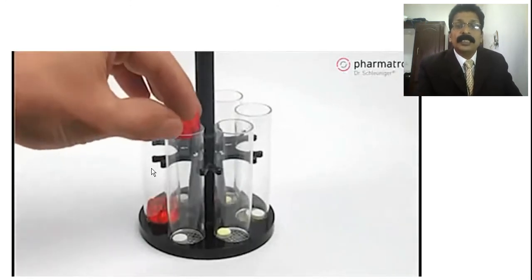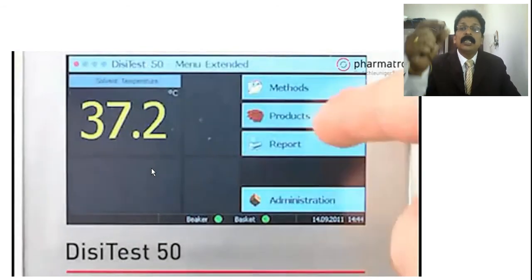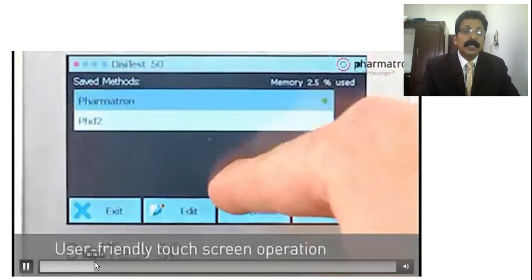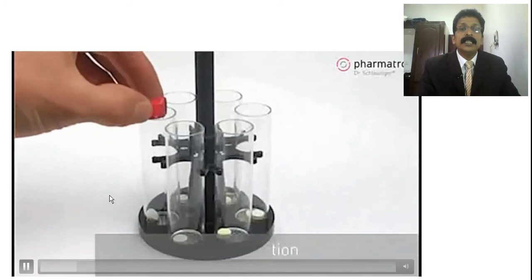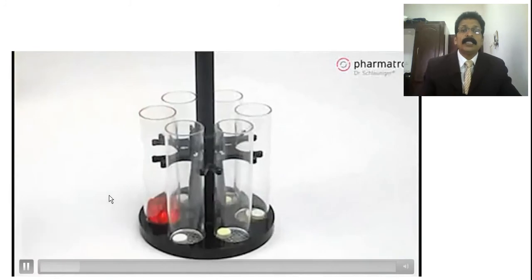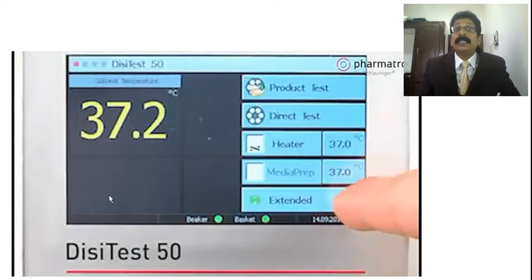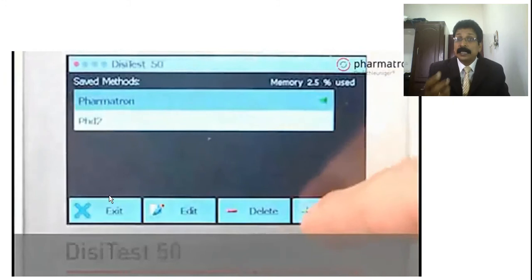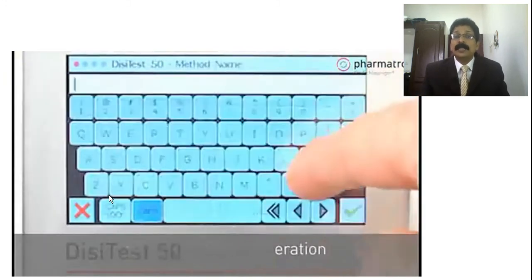You can see the 10 mesh, and after that he is putting a red color, that is called round red color, which I told. You can see that, even if I did not explain, you can just see that red color bead, like what he is putting is the disc over the tablet to get abrasion or to get friction over the tablet, like the same type of feeling in the peristaltic movement which takes place in our GIT.